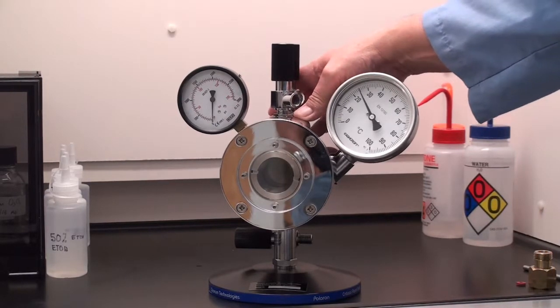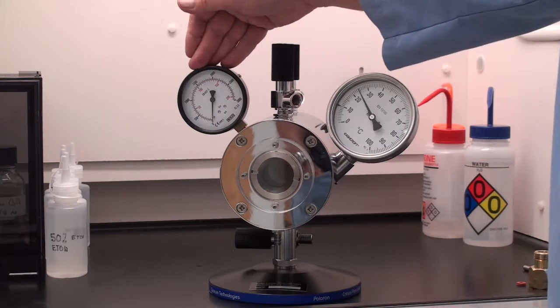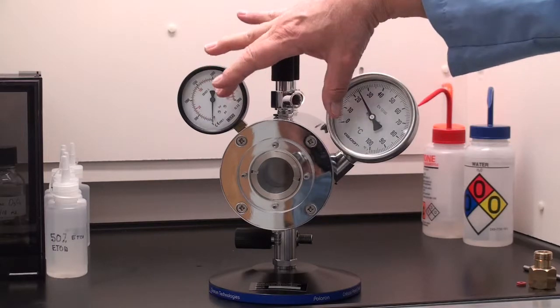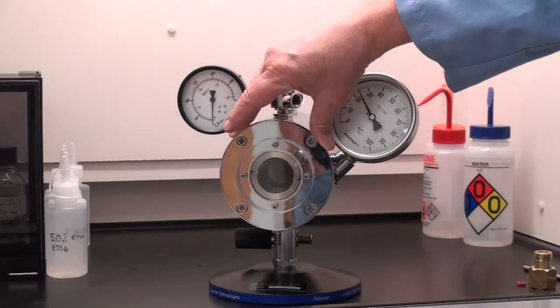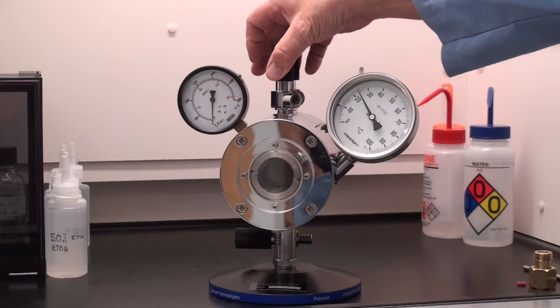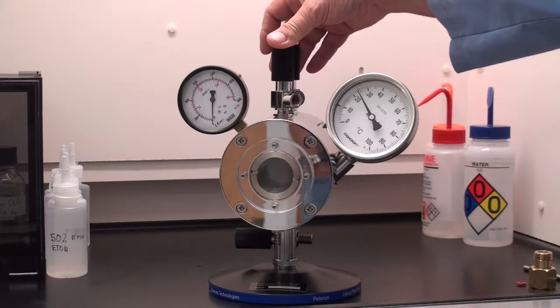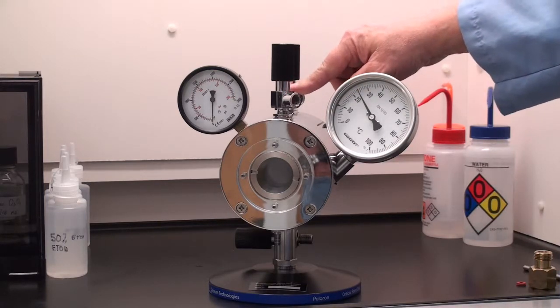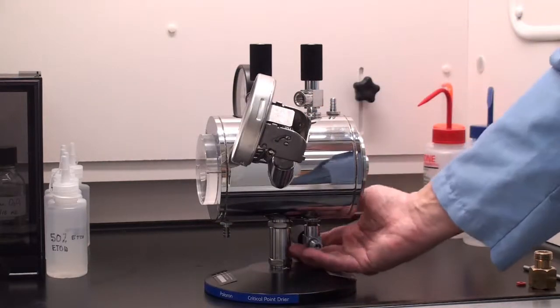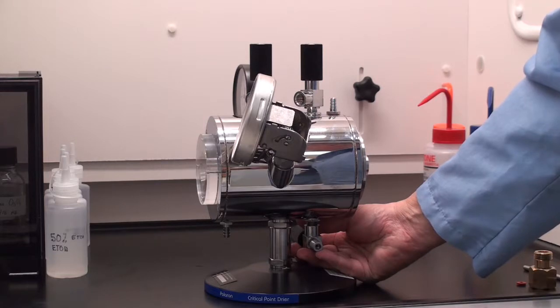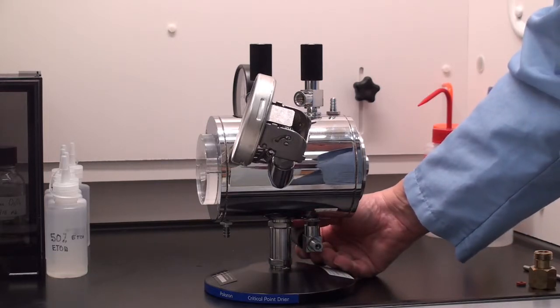Some of the other items you need to know about on the E-3100 is you have the pressure gauge which shows you the pressure inside the critical point drying chamber. You have two valves on top. One is CO2 in. One is CO2 out. And then you have another valve down here at the bottom which is the drain which you let out the intermediate fluid, typically ethanol, so you can get that purged out of the chamber.